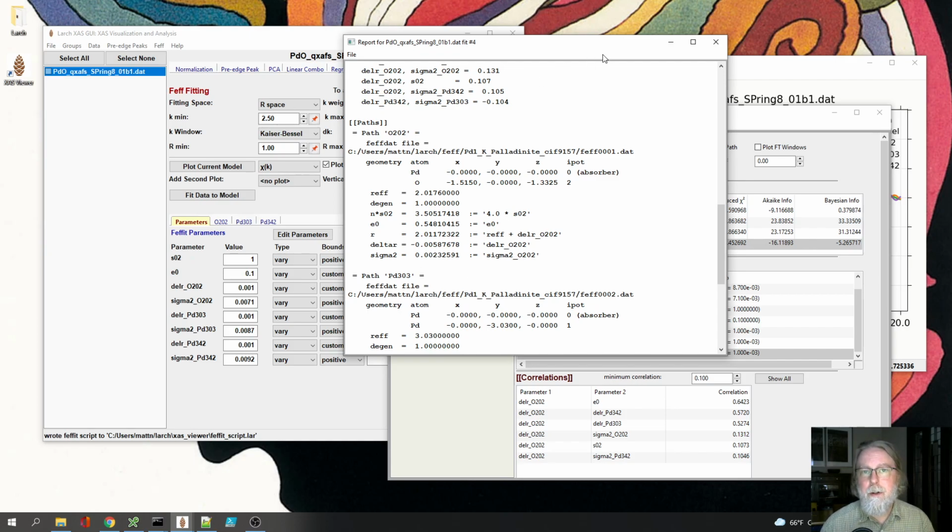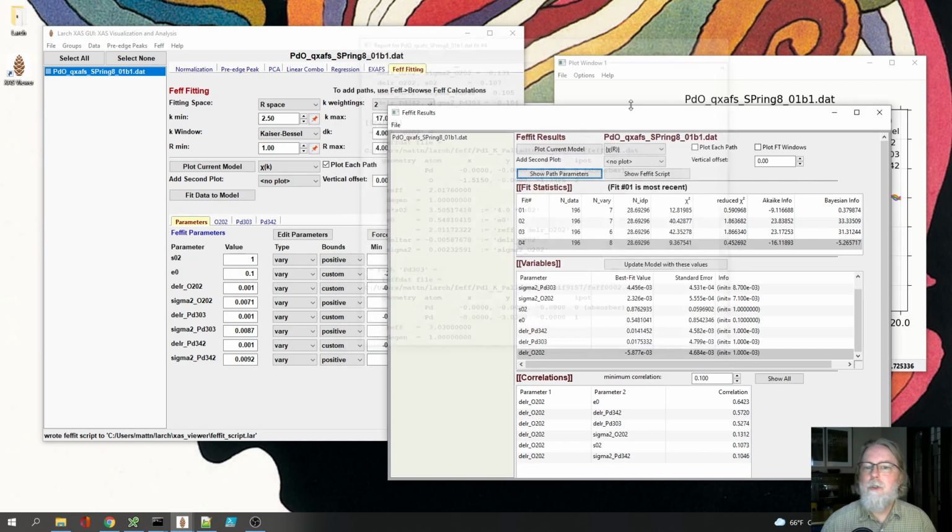If we use a third cumulant, that adds a skew parameter to that distribution, allowing it to be asymmetric. And the asymmetry can favor the closer bond distance or the further bond distance. Both of them are plausible effects. So let's go try that.